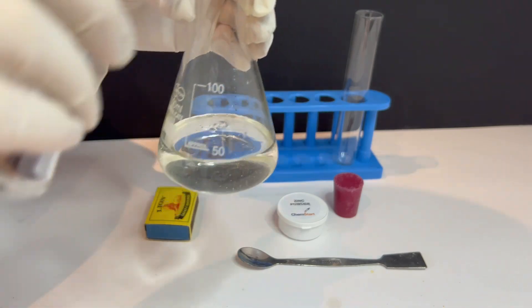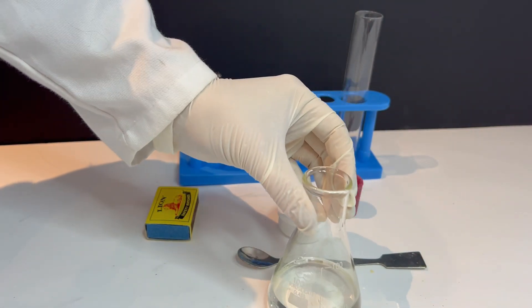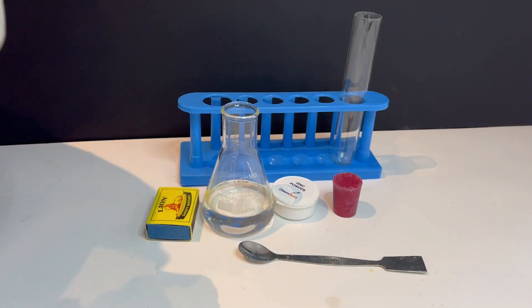The first step is to carefully pour some dilute hydrochloric acid into the flask. Make sure that you are wearing safety goggles and gloves and that you are working in a well-ventilated area.